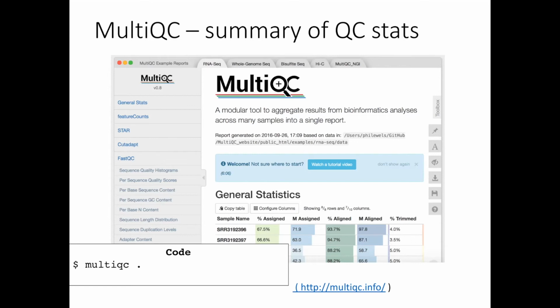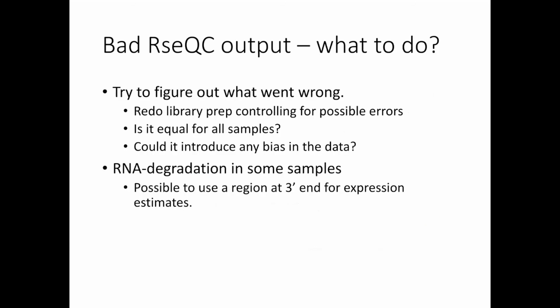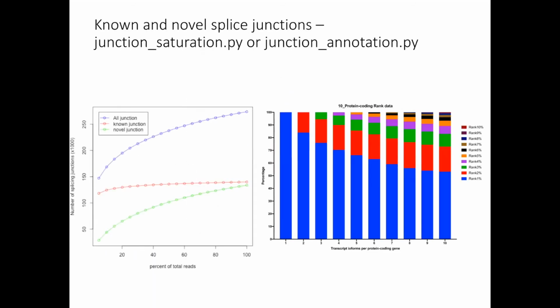Any more questions? Yes, I have a question. In the figures you showed about the percentage of total reads and splicing, why did you mention you think it is not necessary? Because in my idea, you will have a very nice way of coming up with novel junctions, and also all the junctions have the same kind of trend. I didn't get exactly the conclusion of why we think it is not okay.